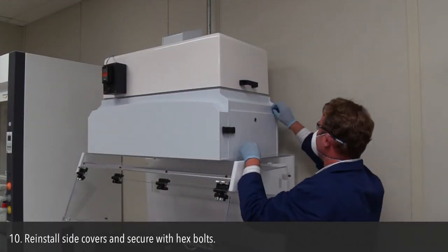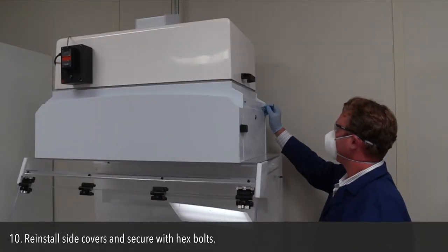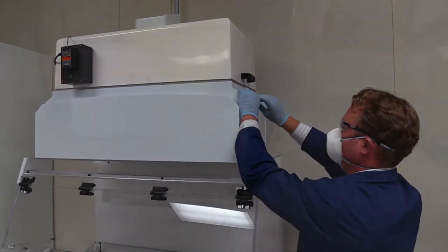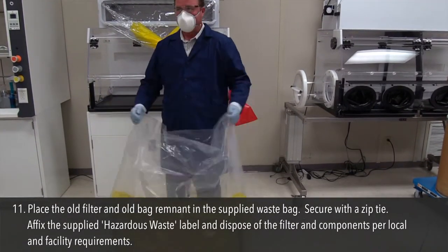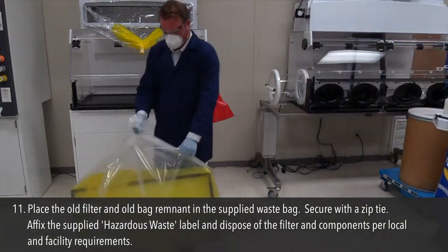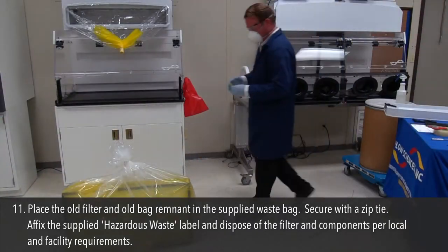Step 10: Reinstall side covers and secure with hex bolts. Step 11: Place the old filter and old bag remnant in the supplied waste bag. Secure with a zip tie. Affix the supplied hazardous waste label and dispose of the filter and components per local and facility requirements.